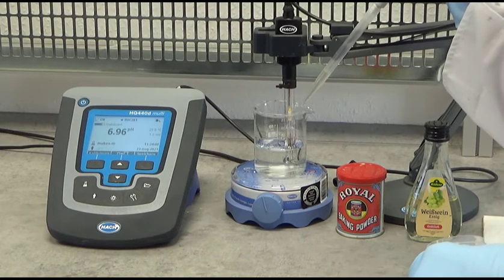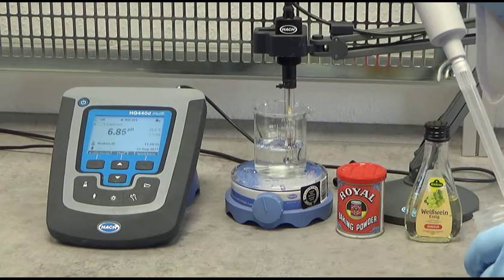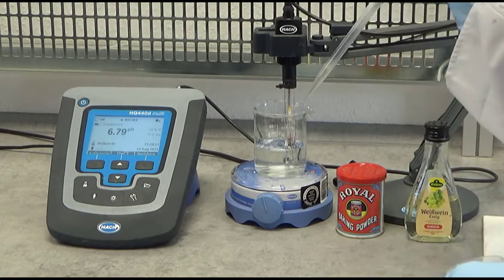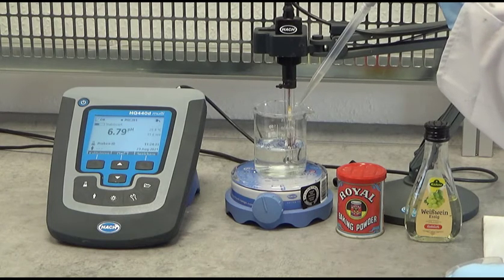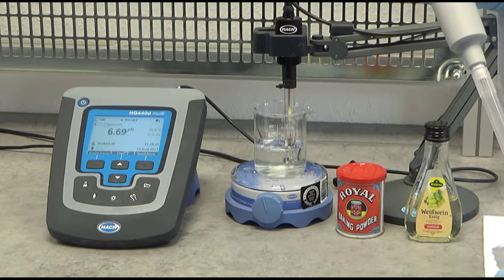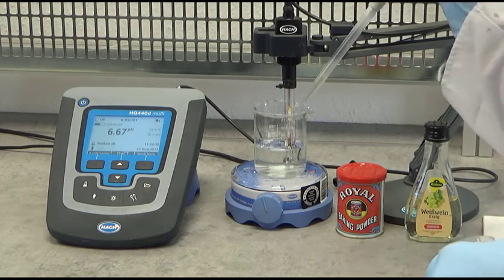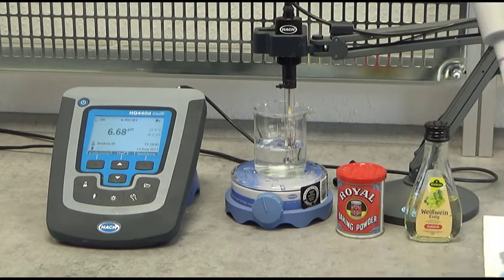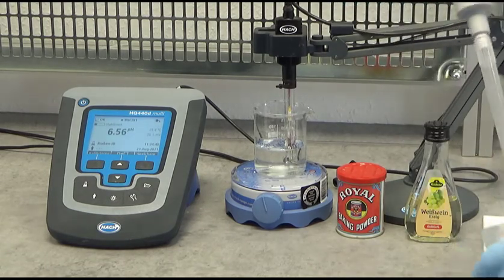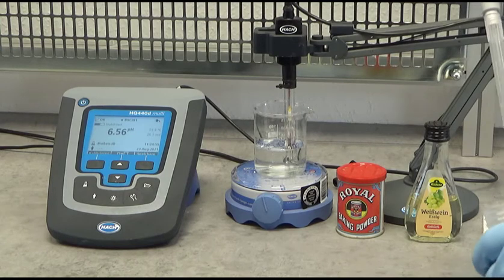I put a second drop — actually I've already added three drops to it. You can see the pH decreases a bit, but not too much. I add another two drops, then another two drops. The pH decreases very, very slowly and there is almost no change. That means there is something in the water which absorbs the acidity from the vinegar so that the pH cannot drop.